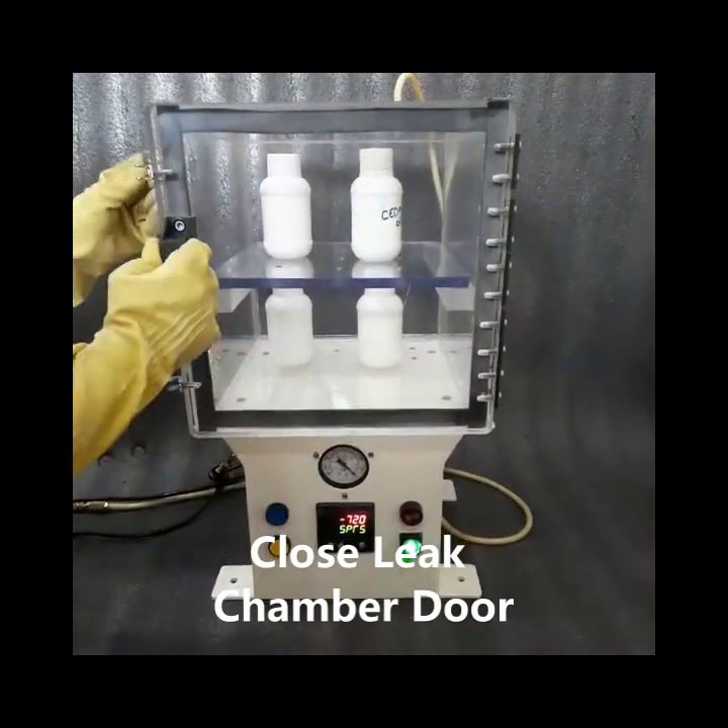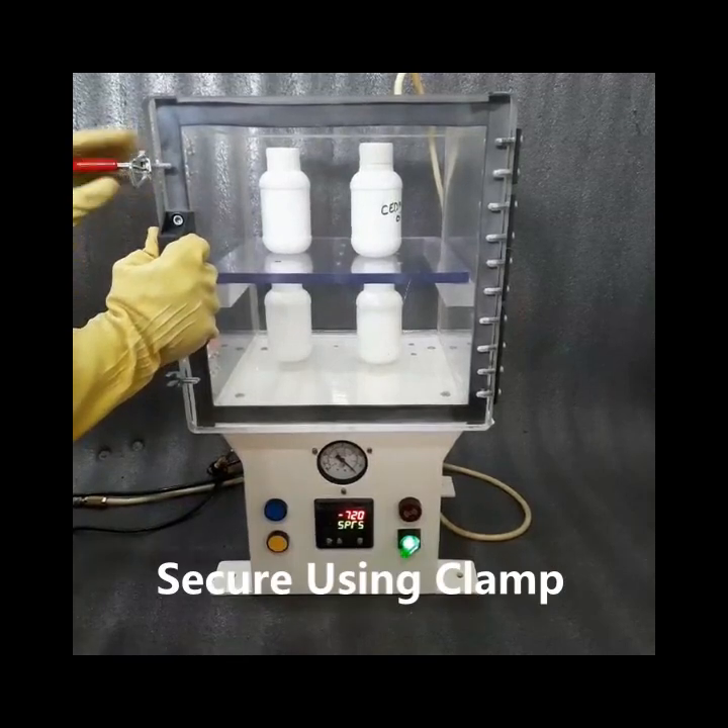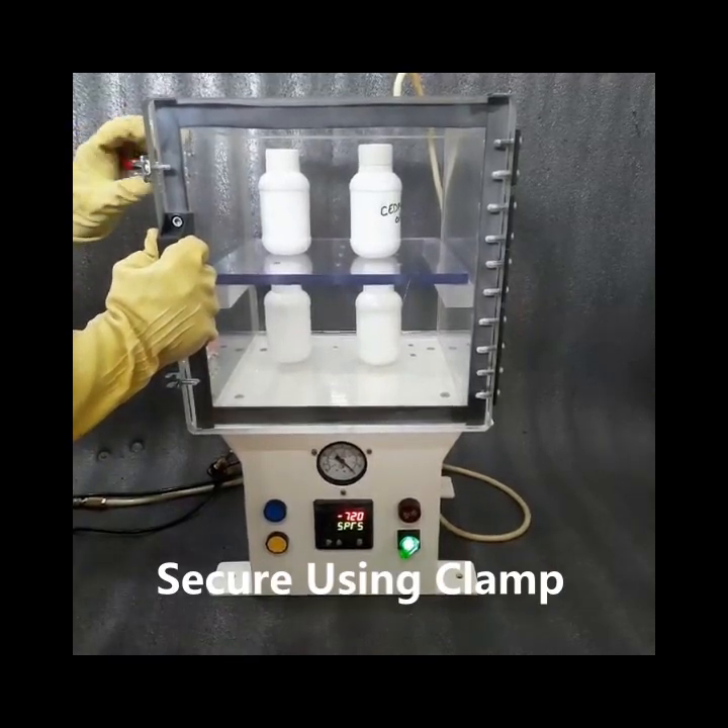Now close the leak test chamber door and secure it using the clamps.